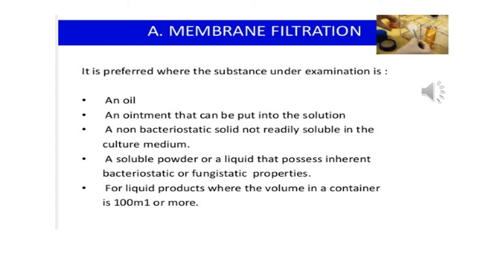The sterility test is performed by two methods. First is membrane filtration and second is direct inoculation. In membrane filtration, you take your solution and filter it through a membrane filter. Then you take that membrane filter and put it on a petri plate which contains your agar or nutrient medium. If the solution filtered through contains a contaminant such as microorganisms, the petri dish after incubation will show growth, and in that case you claim that your sterility test has failed.